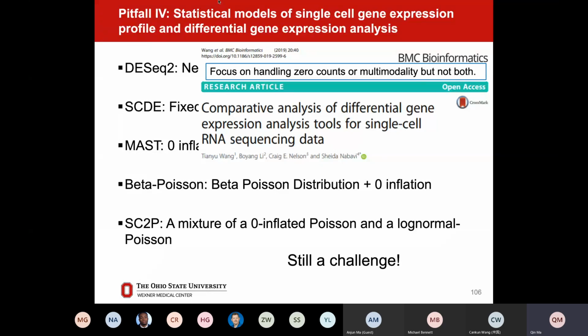Listening to the group, any comments or questions? Feel free to ask. You can ask questions regarding the Rmarkdown we introduced earlier today, or discuss any pitfalls I just showcased here. Anything is welcome.